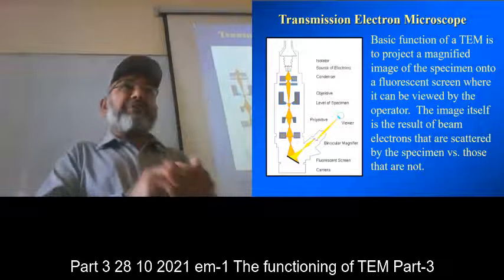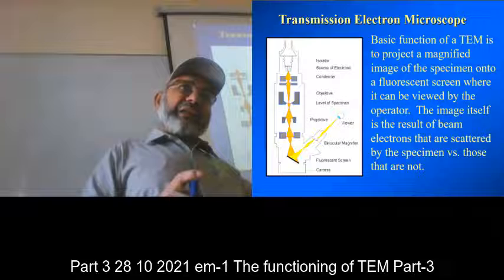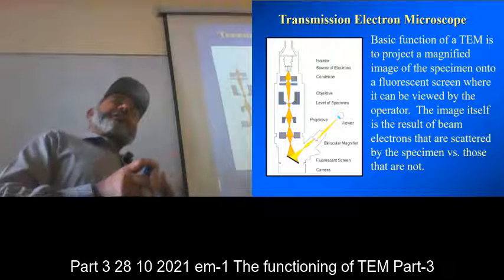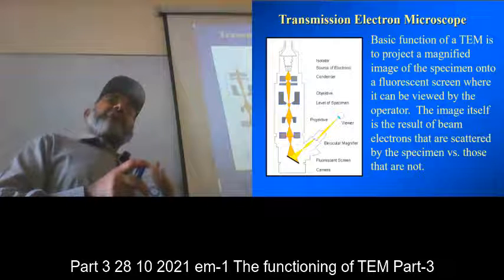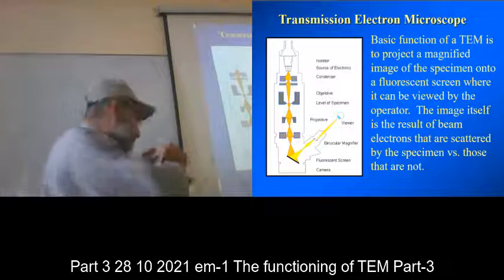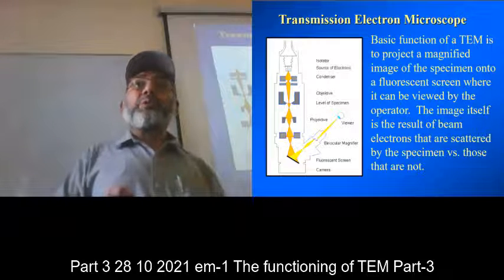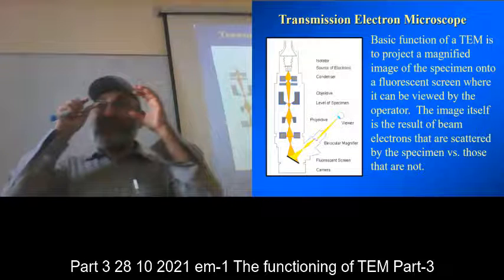So if the magnification on the screen was 1 million, then by using that, you bring that to the ocular focus, when you are looking into that screen, it appears 10 times more with the eyepieces.